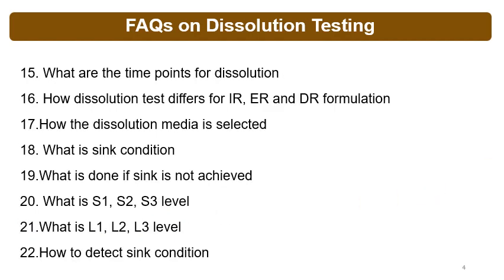15 number question is, what are the time points for dissolution? Generally the profiling is done starting from 5 minutes, 10 minutes, 15, 30, 45 and 60 minutes for IR formulations, but the specification time points are generally 15 minutes, 30 minutes, 45 minutes and the 60 minutes.